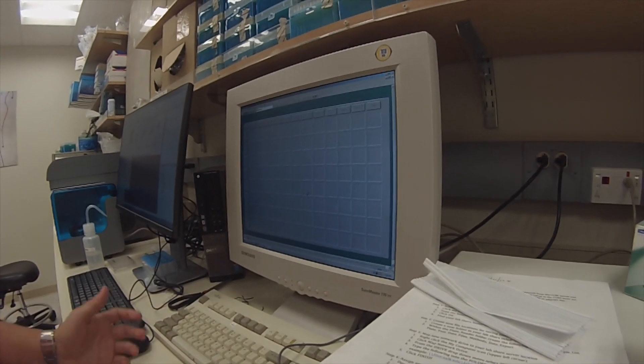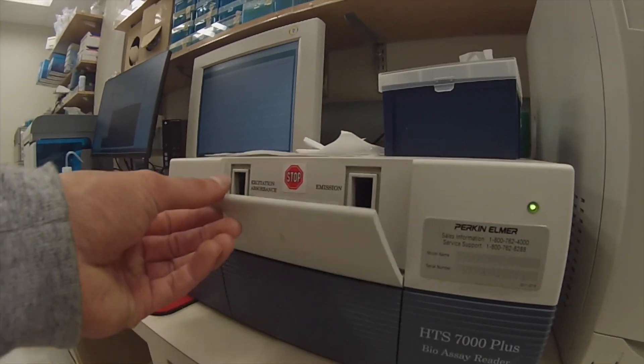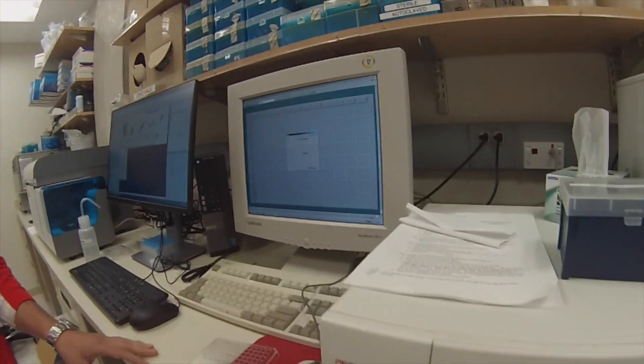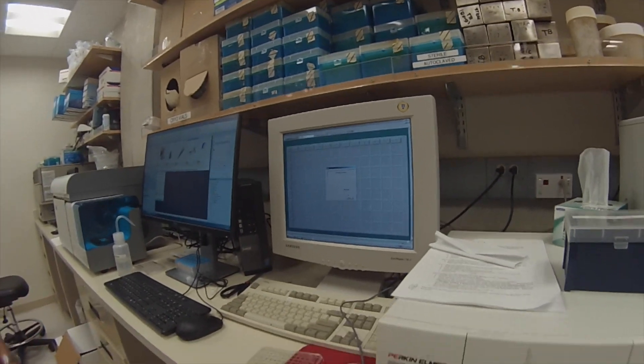We'll start the measurement. It will take a while but we'll wait for our results. That's how we set up.